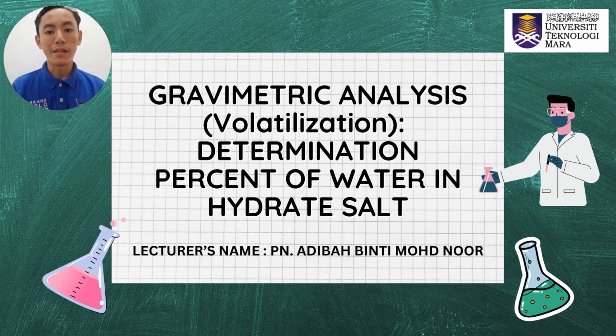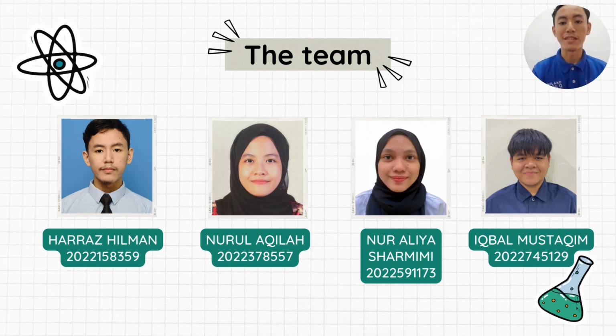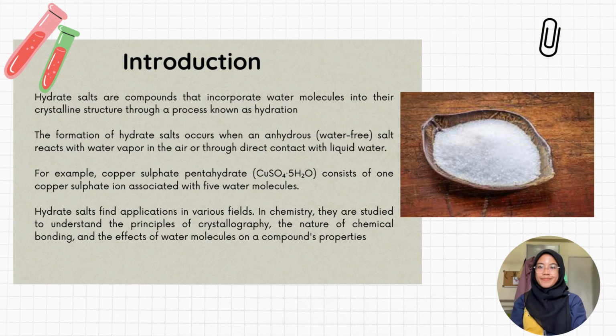My team and I would like to present gravimetric analysis with the title Determination percent of water in hydrate salt. And these are the members of the group.